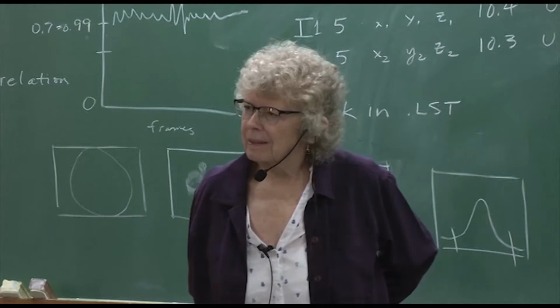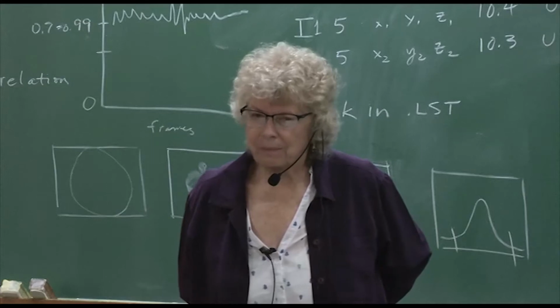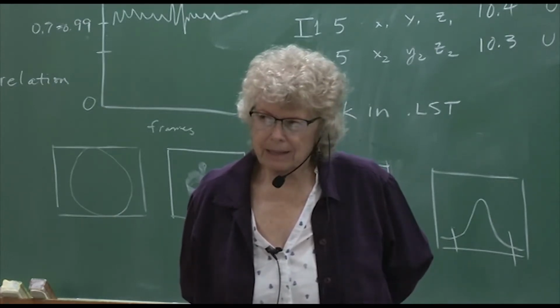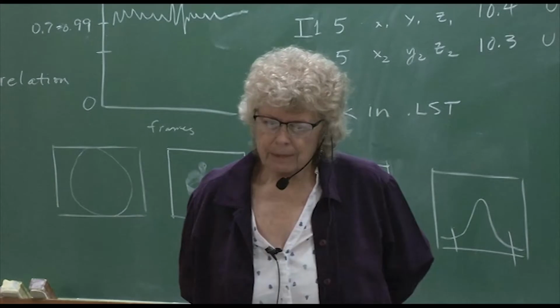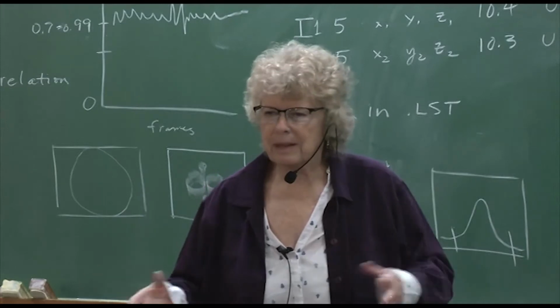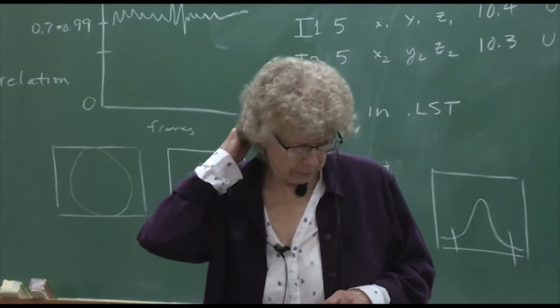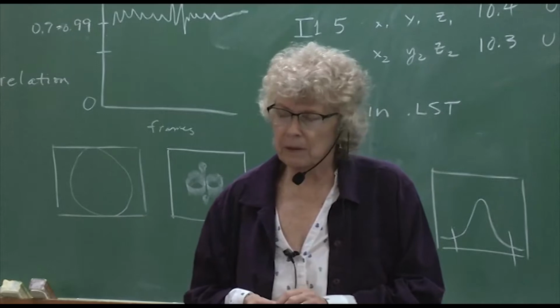What is the difference? We use, instead of LS, we use CGLS. Oh, the CGLS. That is somewhat obsolete, the CGLS thing. I don't think I've used it for many, many years. Because of computers, the program can now invert very large matrices, and that was, I think, the main reason to use the CGLS before. It couldn't handle the parameters. But I think just regular least squares now is all anyone ever uses.